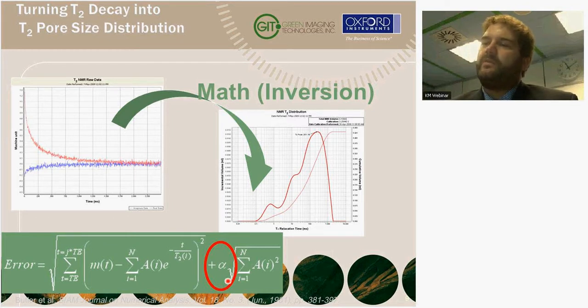What we want to do is introduce a term that allows us to introduce dependencies on that exponential signal lifetime. What I'm trying to say is, if you have a pore size that's 1 micron, it's very likely that we'll have at least some pores that are 1.1 micron, right? So we don't just have an impulse response of 1 micron pores. It's a good distribution of pores. So that information helps to converge this solution.